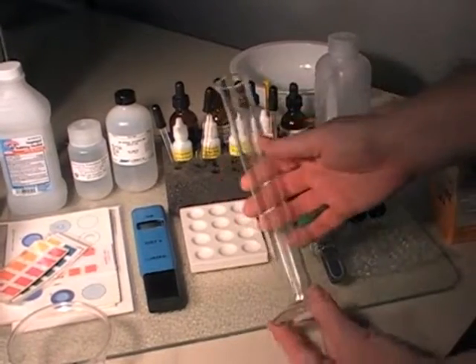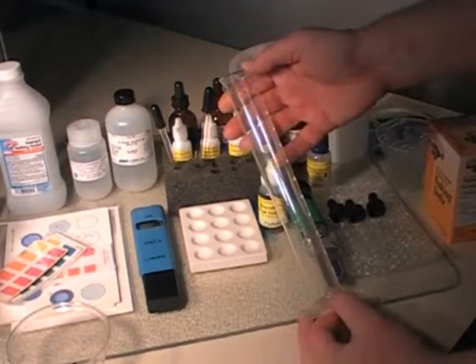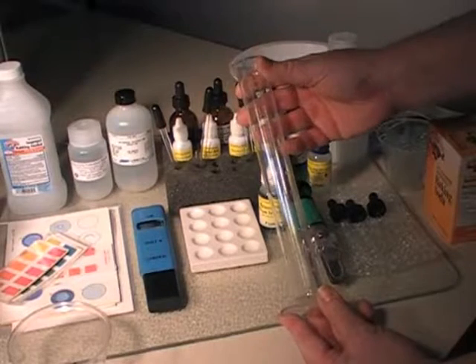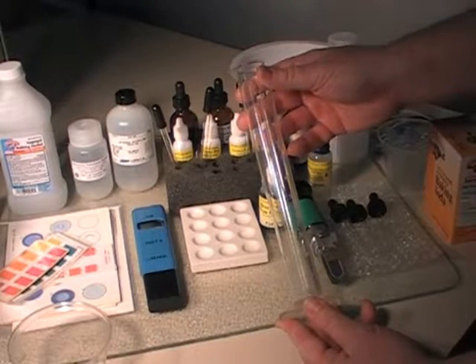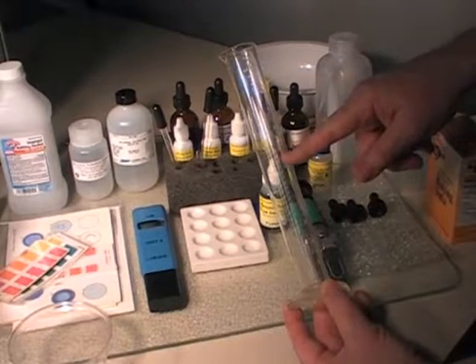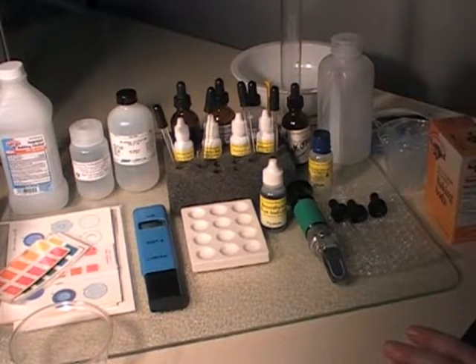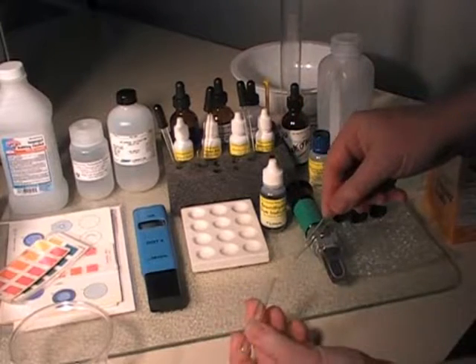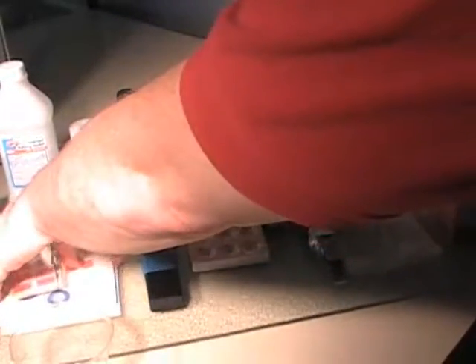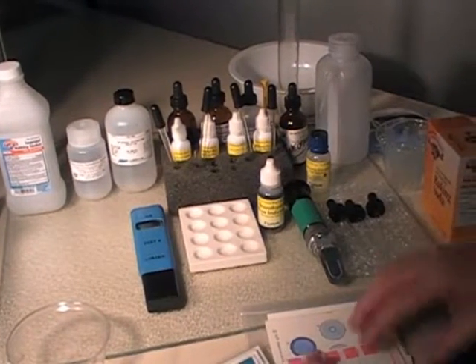Another piece of labware you'll need is a graduated cylinder, available in glass ($13) or plastic ($18). This is primarily used for the dilute method of salt testing. We already discussed the extra glass pipettes. The culture tube packets are also listed — buy one and it'll last a long time. Finally, you'll need copies of the color cards for reading pH and urea results.